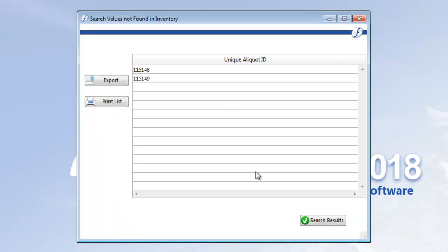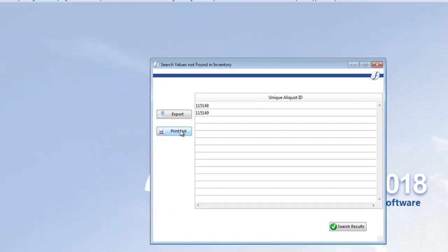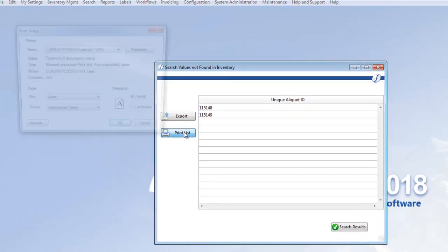Now, this is a message you'll see if there are any values you scanned but didn't find in Freezerworks. We'll provide the values and the ability to export or print the information. I removed these aliquots on purpose for this demonstration, but let's print a report of the information anyways.